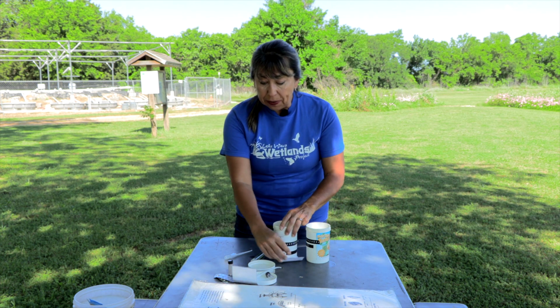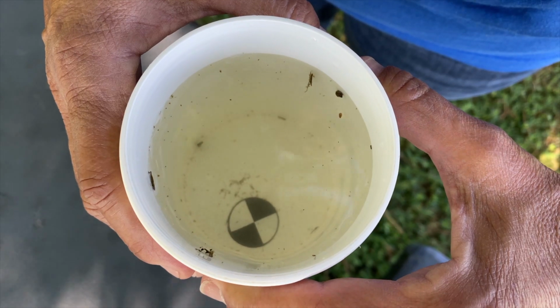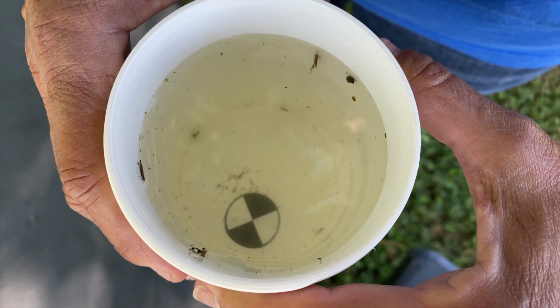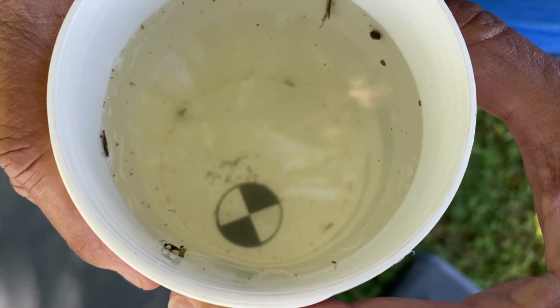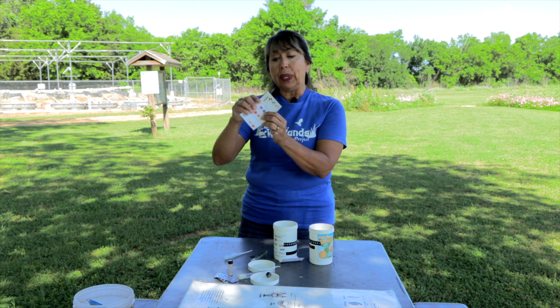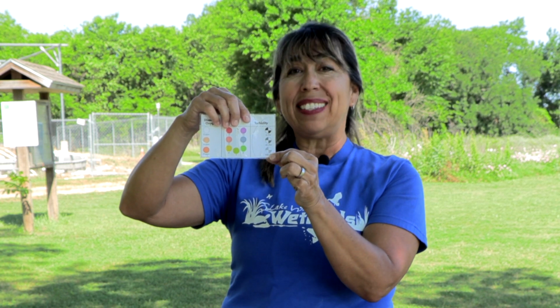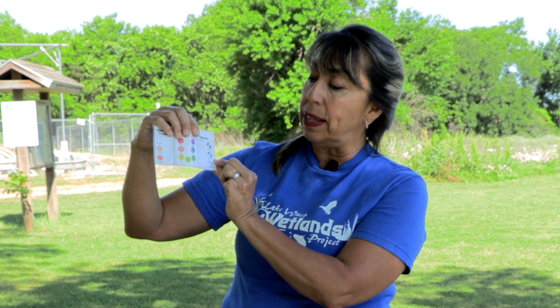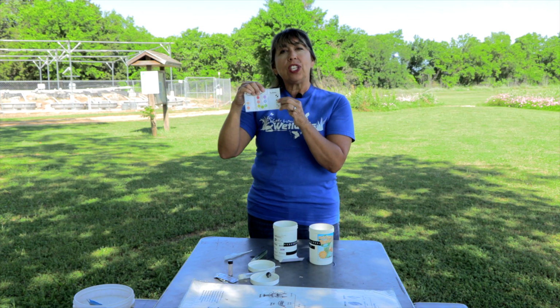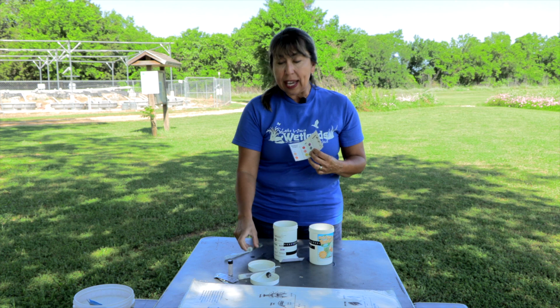So what we're going to do first is look at the turbidity, and inside the jar we have a little Secchi disc decal down at the bottom of this sample jar. It's a black and white disc, and it tells you visually how clear or how cloudy the water is. So in our sample right in here, you can see how clear it is, how kind of a little murky it is, or if you just cannot see it at all. And that's measured in JTUs, Jackson Turbidity Units. In my sample, just looking at it, I'm going to call it right in the middle, so I'm going to say it's 40 JTUs. This will make sense to you when you read a little bit more about it on the World Water Monitoring Day website.